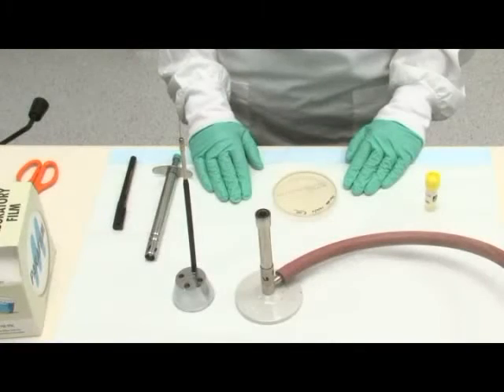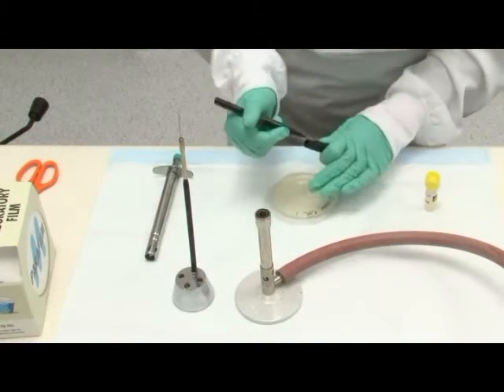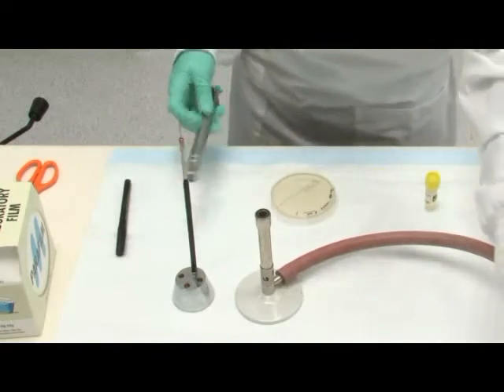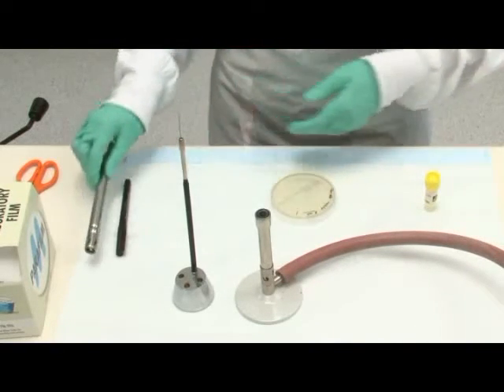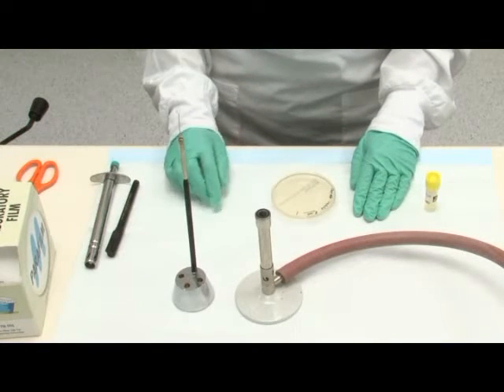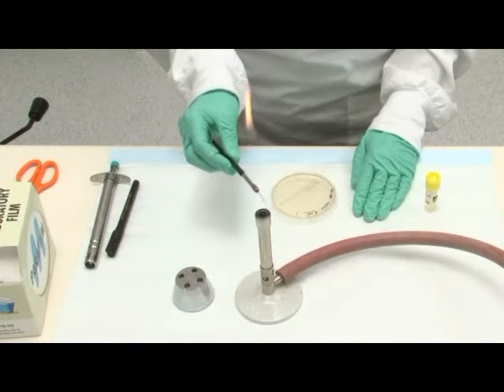Mark the base of your plate where you will inoculate it with culture. Turn on and light the Bunsen burner. Take care you're not leaning over it. Sterilize a wire inoculating loop by flame and ensure the wire turns red.